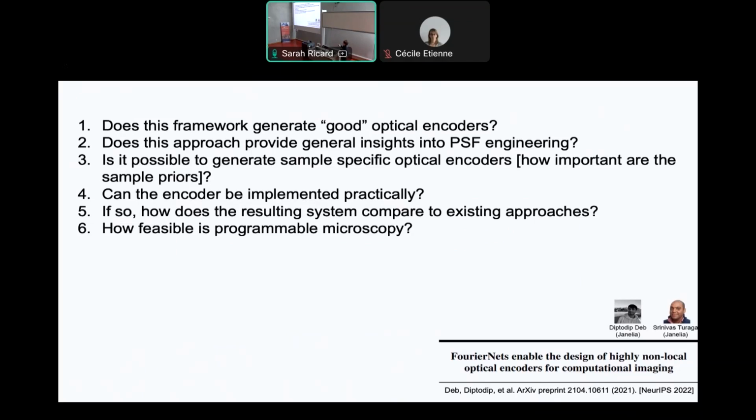And in this case, what was happening was that it was using the entire pupil to generate these perspective views in order to give us the 3D information. So that was a nice result, because the deep network was giving us something that we already knew, or that people had built as a sensible thing to do for volumetric imaging, but it was just doing it better.